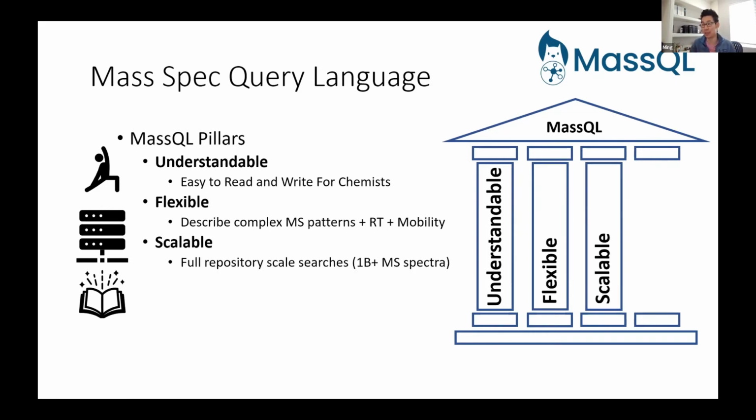It needs to be scalable. So this is kind of the biggest thing. So maybe it wouldn't be the biggest deal in the world for you all to write your own R or Python code to do something like this for a particular pattern. But then the real trick at that point is maybe it'll work for one file, but will it work for 200,000 of them over a billion spectra? Generally, probably not. It's just not the forte of chemists to build scalable parallel systems.